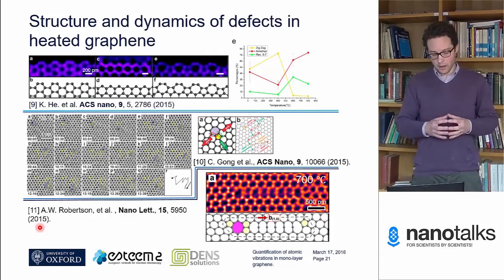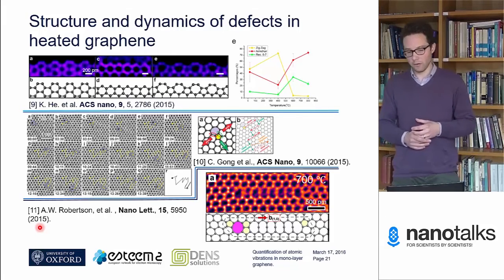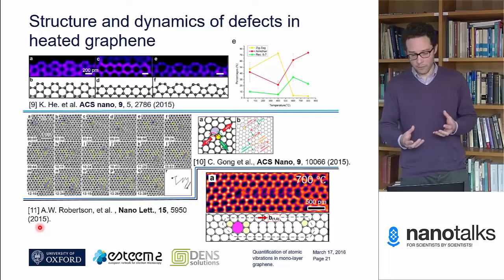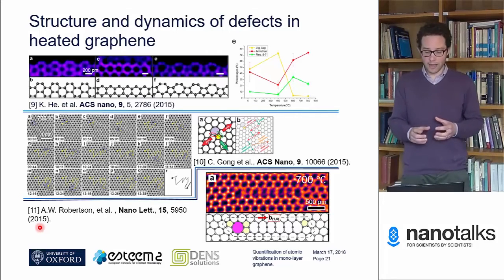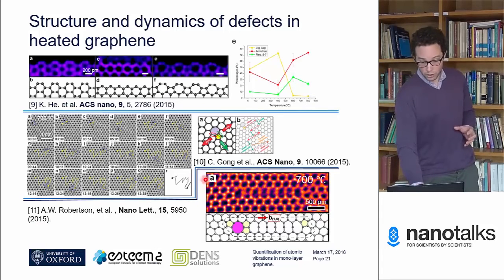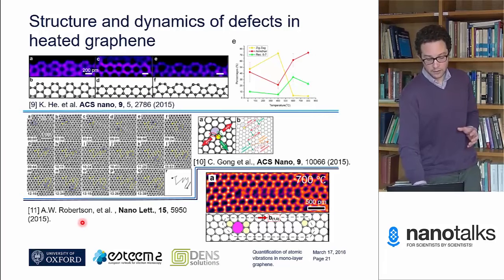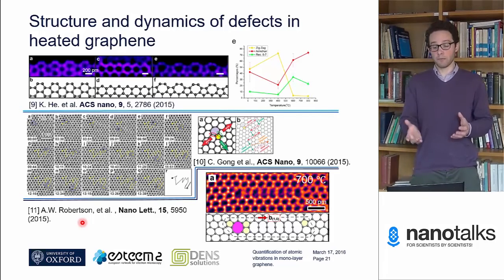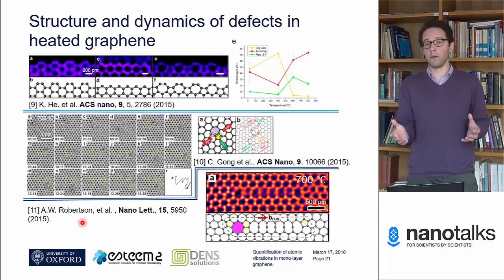So we now want to try and understand how much thermal energy there is in our samples, and we then come to the question: how do we define that? So far, I've shown images with temperature on the images. So this is 700 degrees centigrade in these experiments. Temperature is a thermodynamic property, and it's only well defined within the thermodynamic limits.